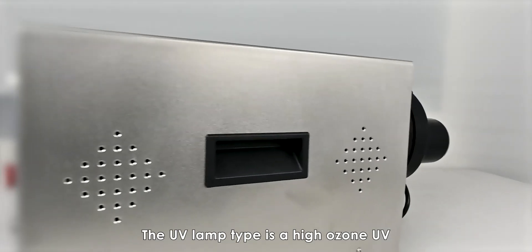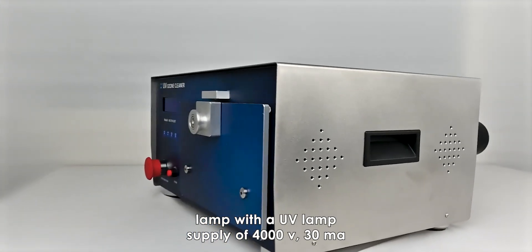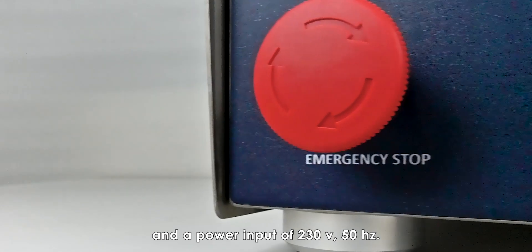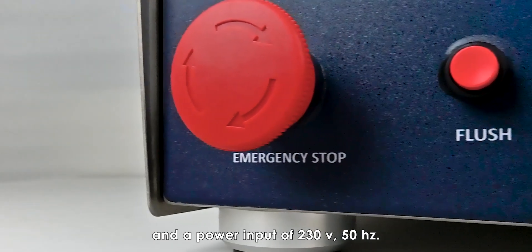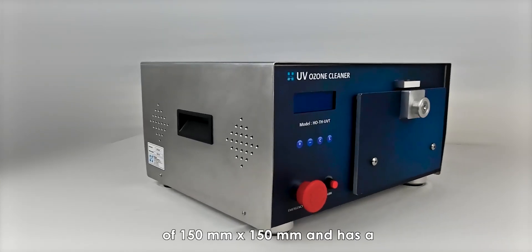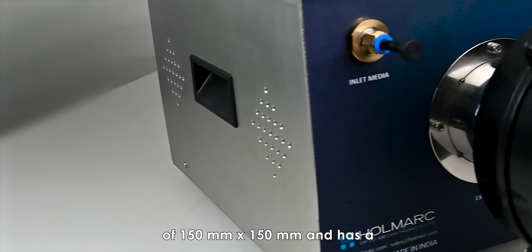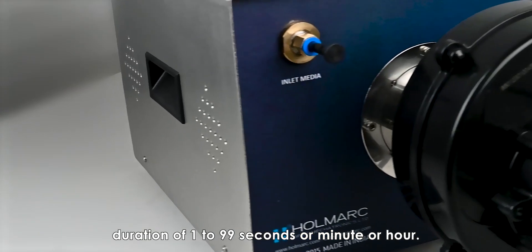The UV lamp type is a high ozone UV lamp with a UV lamp supply of 4,000 volts, 30 milliampere, and a power input of 230 volts, 50 hertz. The machine can handle a maximum substrate size of 150 mm by 150 mm and has a duration of 1 to 99 seconds, minutes, or hours.